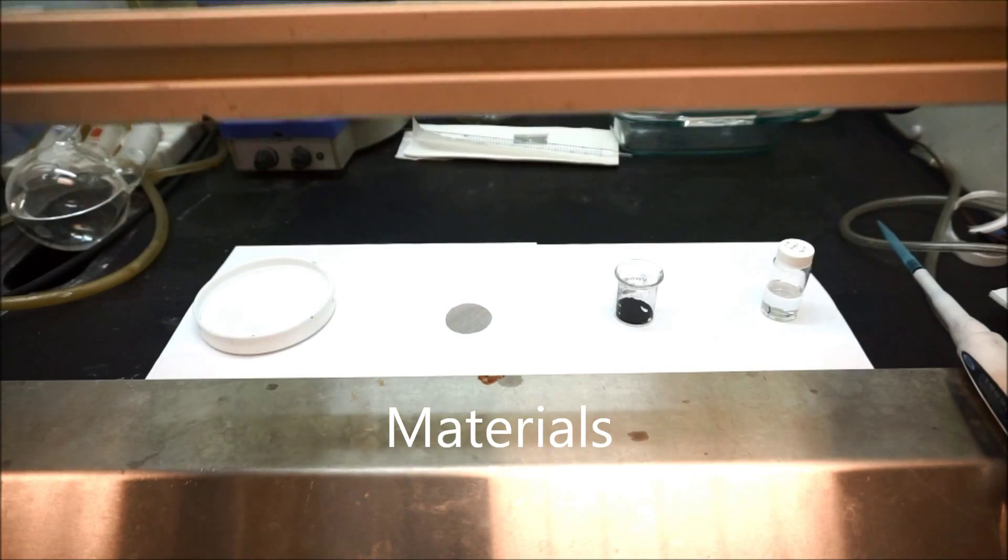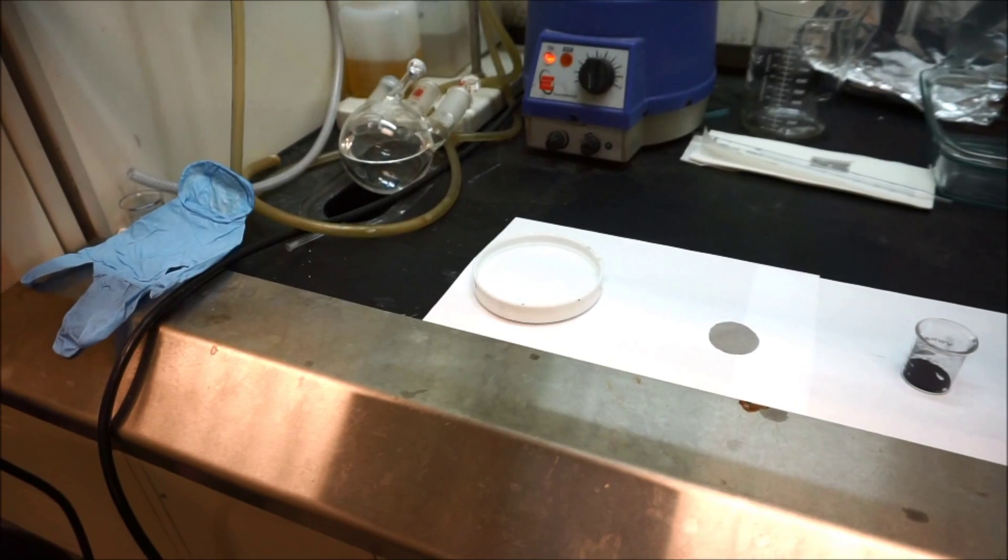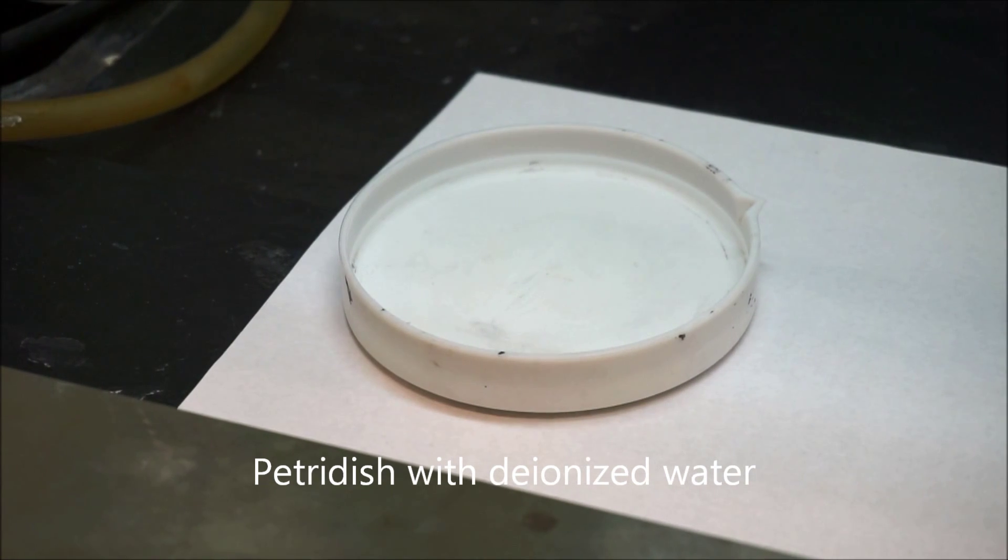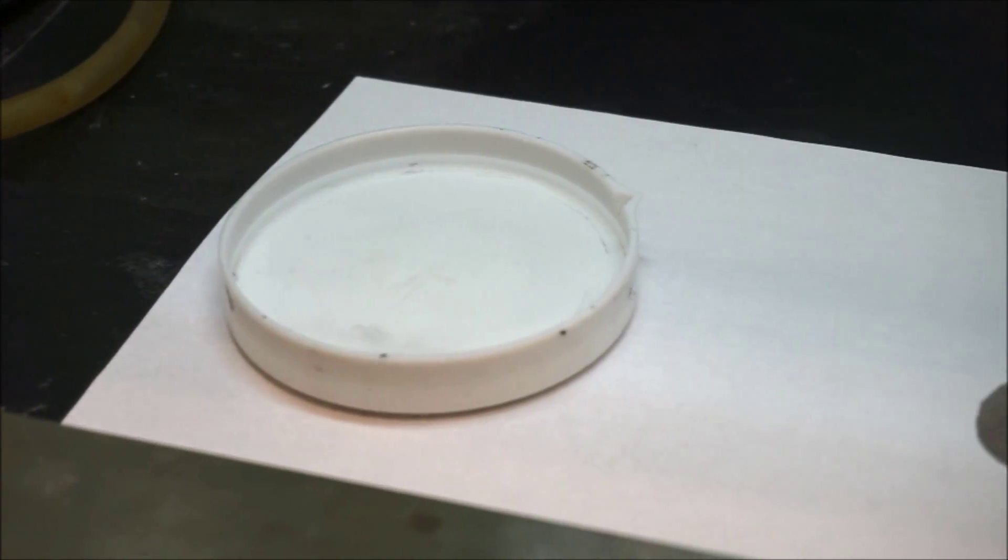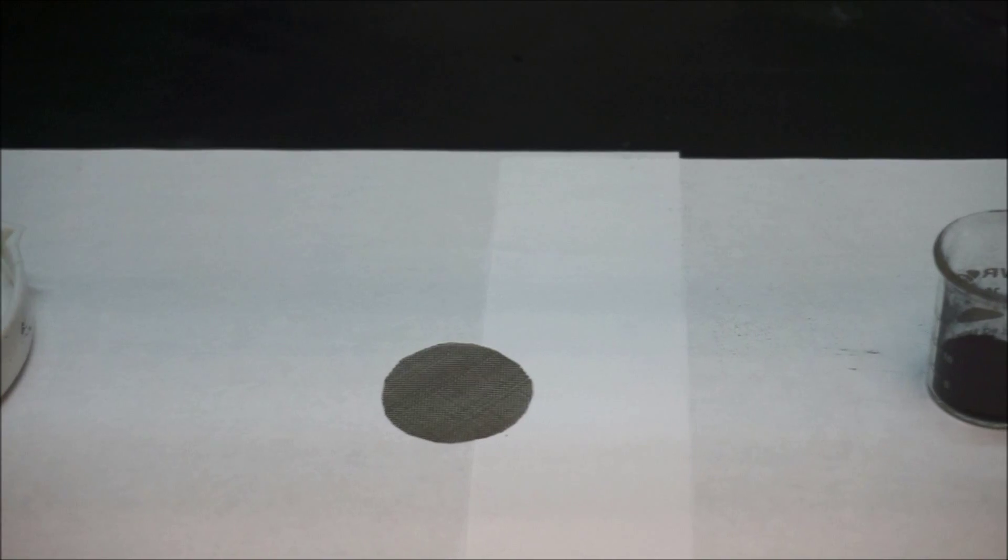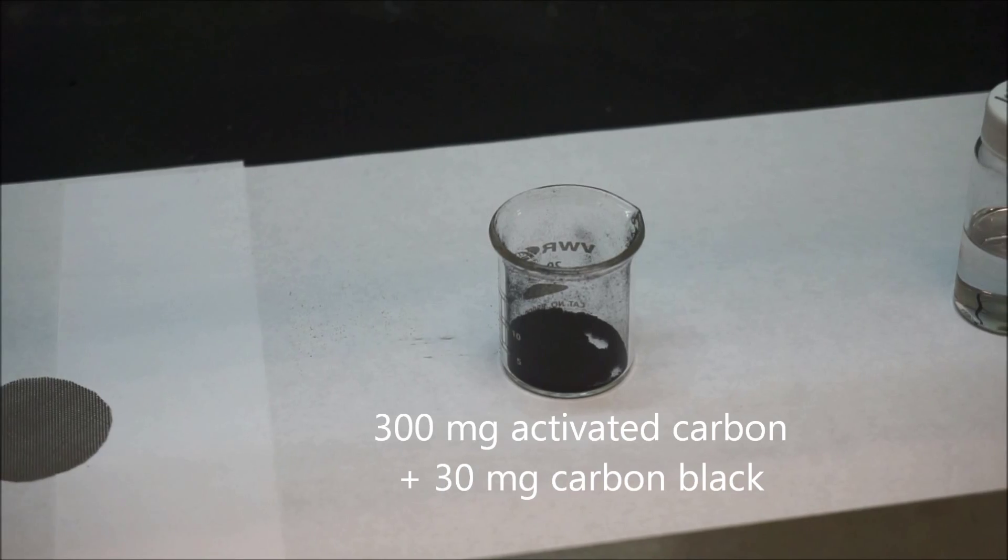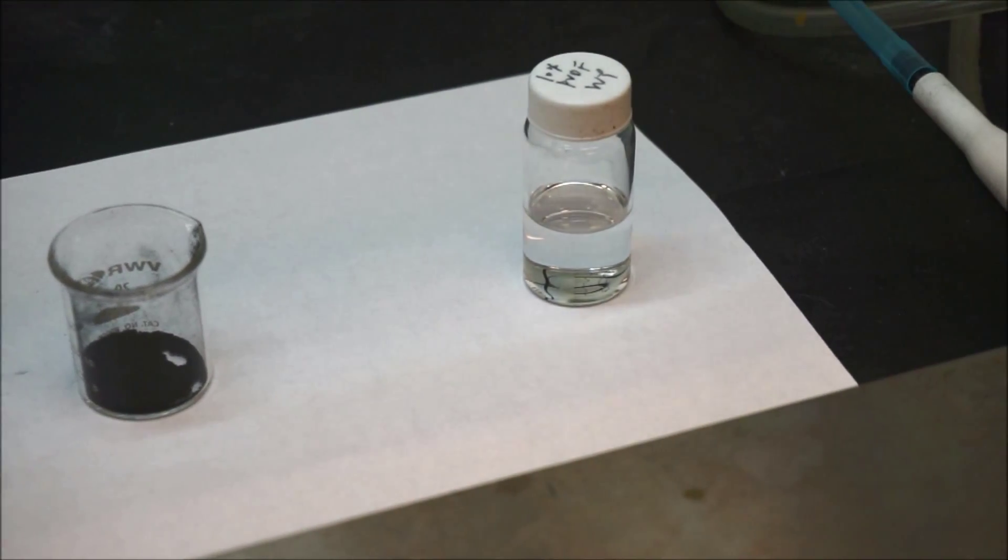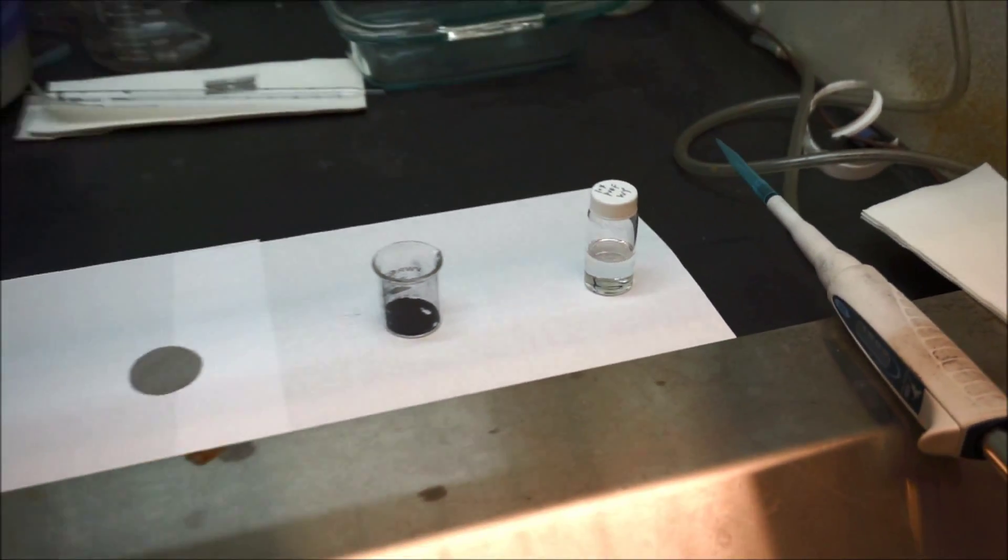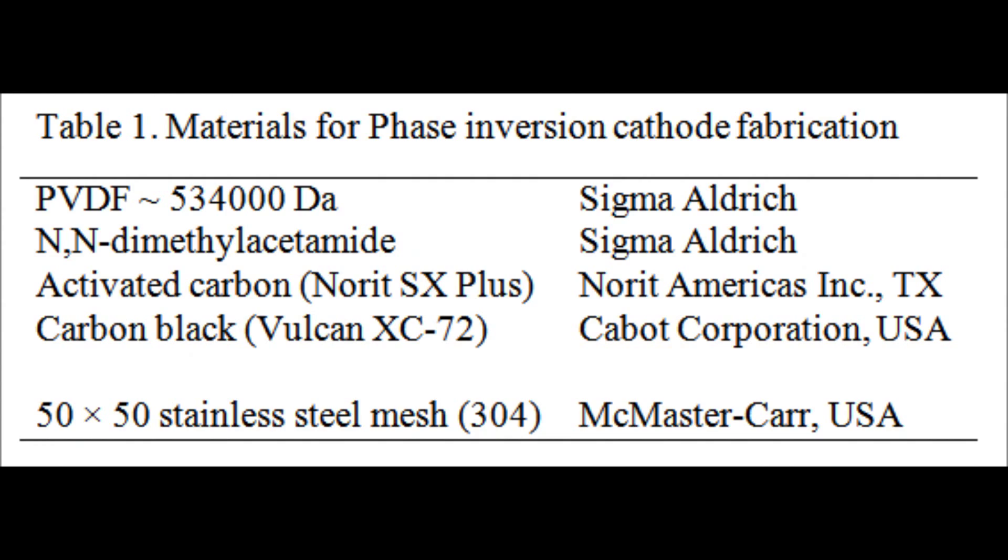So first let's take a look at the materials and equipment we need to use to make the active carbon air cathodes. The first one is the petri dish filled with deionized water, and the second one is the 50 by 50 stainless steel mesh as a current collector. And also we need active carbon powder and carbon black powder. In this case we use 10% PVDF solution as the binder. Here is a table showing the chemicals and manufacturers.